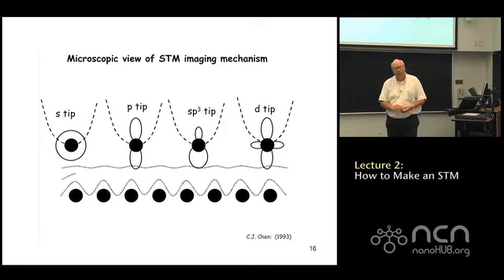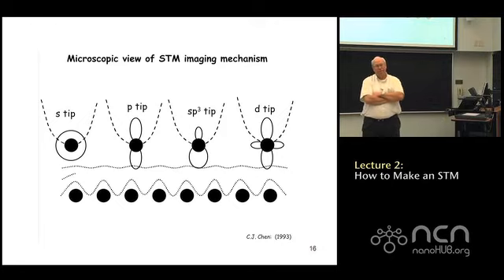So given that you can have all these orbitals present, the choice of which one you choose is basically by the bias voltage, right? You can push up, or you can make sure the tunneling occurs from states that correspond to certain wave functions. Isn't that how you control it? Yeah, so there are two ways to adjust which state you tunnel through. One is by adjusting bias voltages, because you can then have a little bit of control over the states that tunnel. The other is by adjusting the symmetry of the atom on the tip, right?